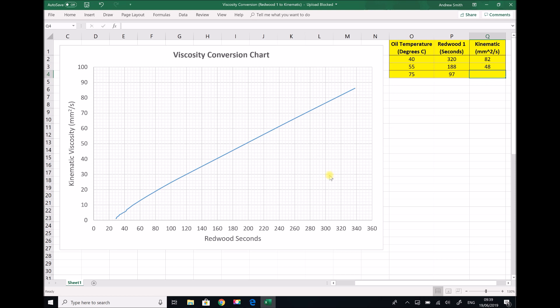And finally, for 97 seconds: we have 80 seconds with each square being 4 seconds, so here we have 96 on the axis. Tracking upwards until we strike the line, we can see that yields a kinematic viscosity of 24 millimetres squared per second.